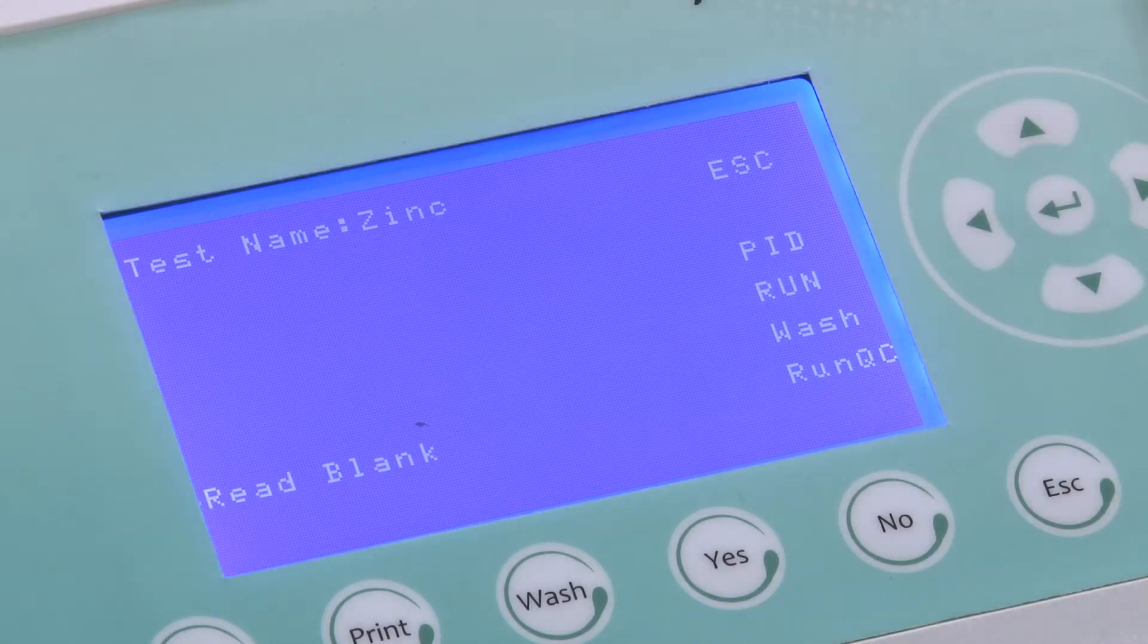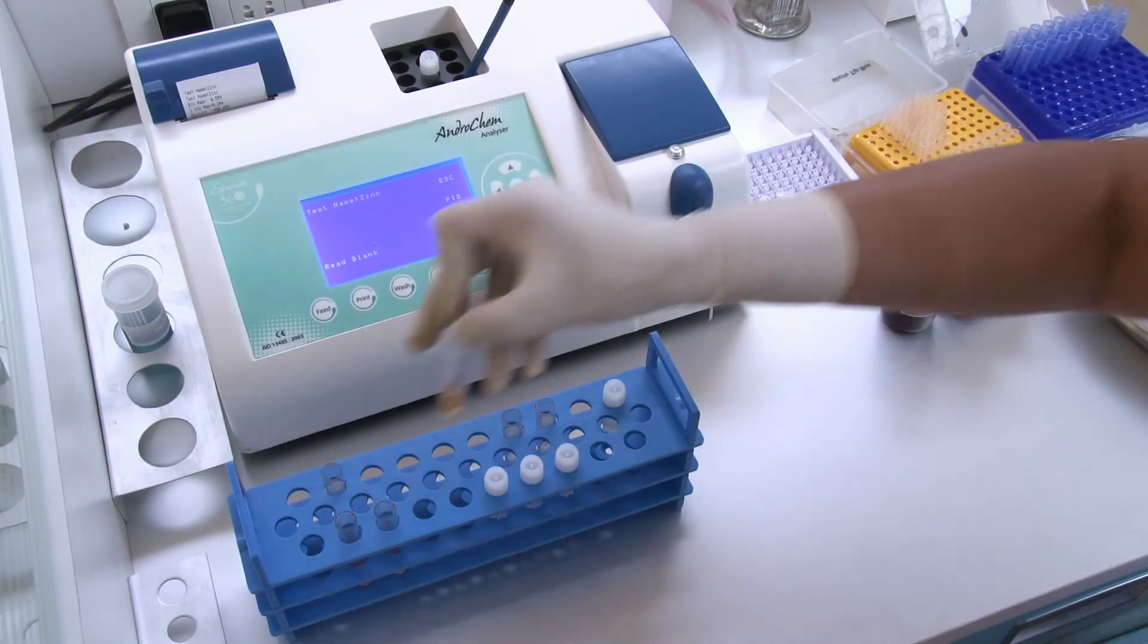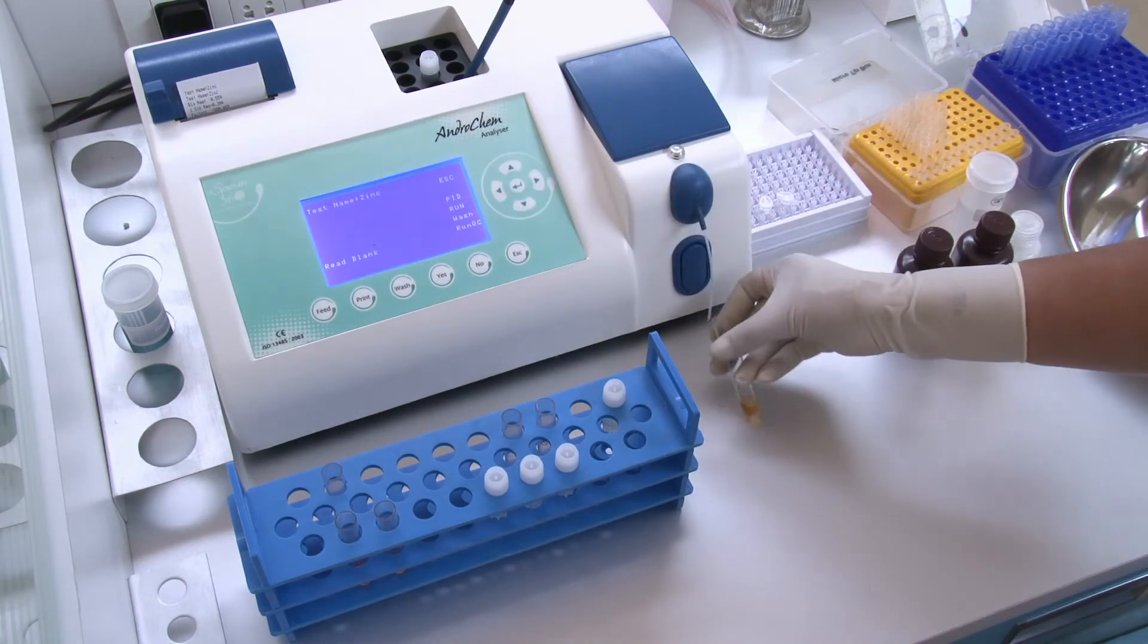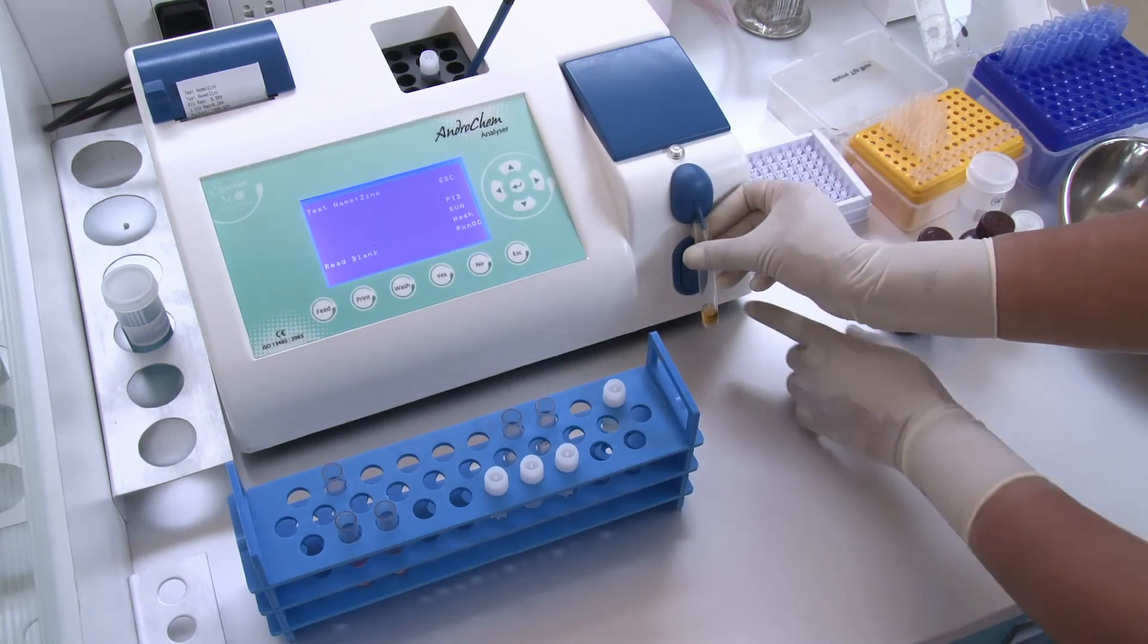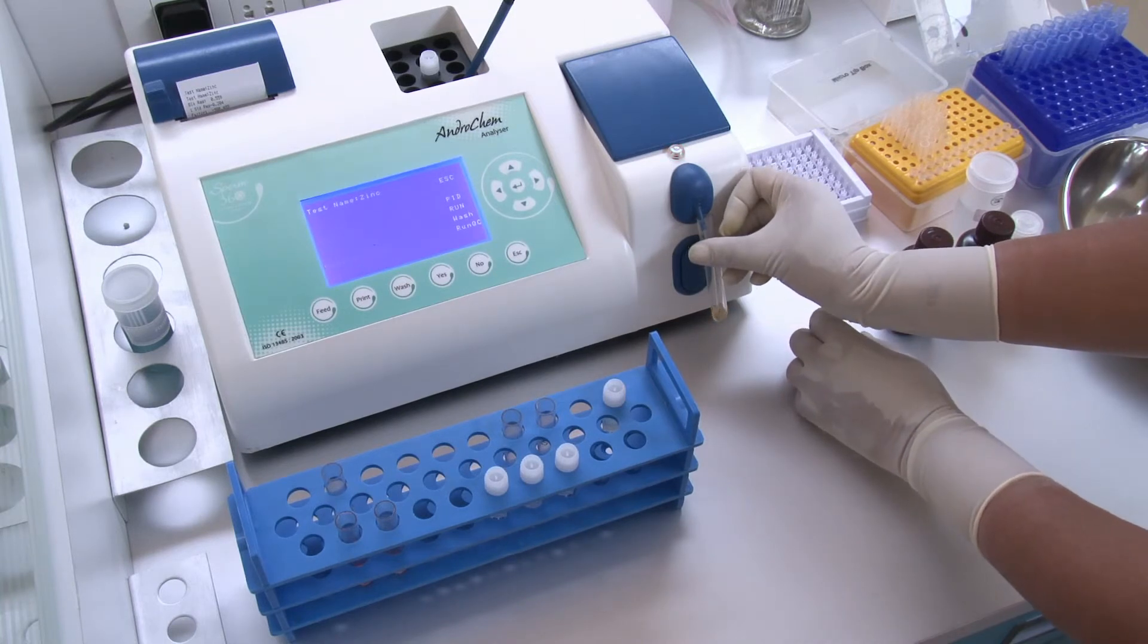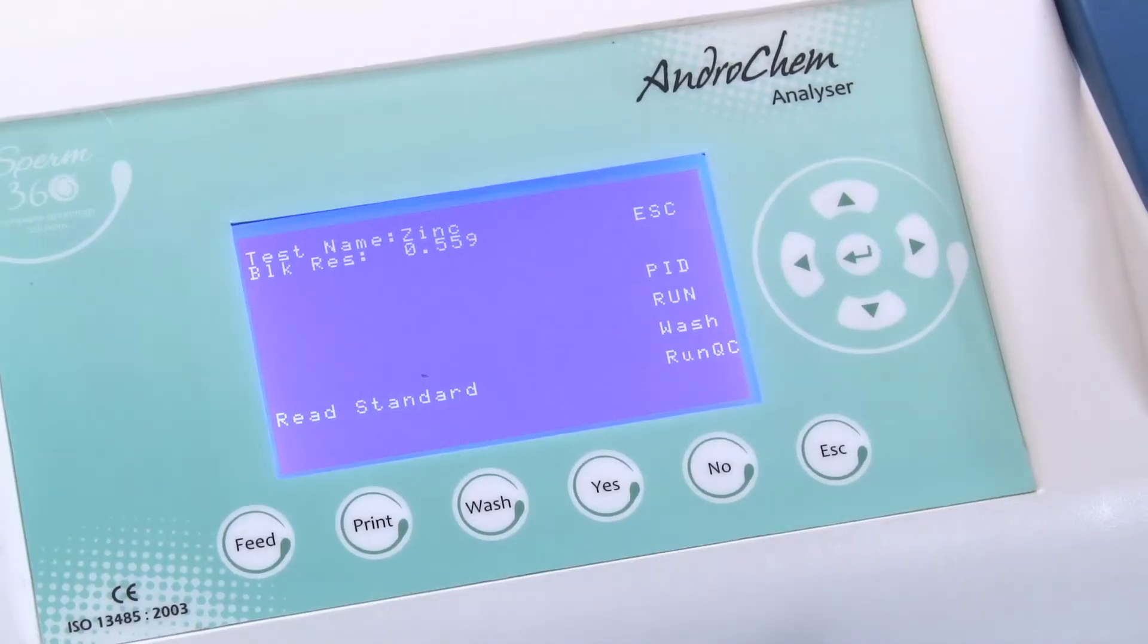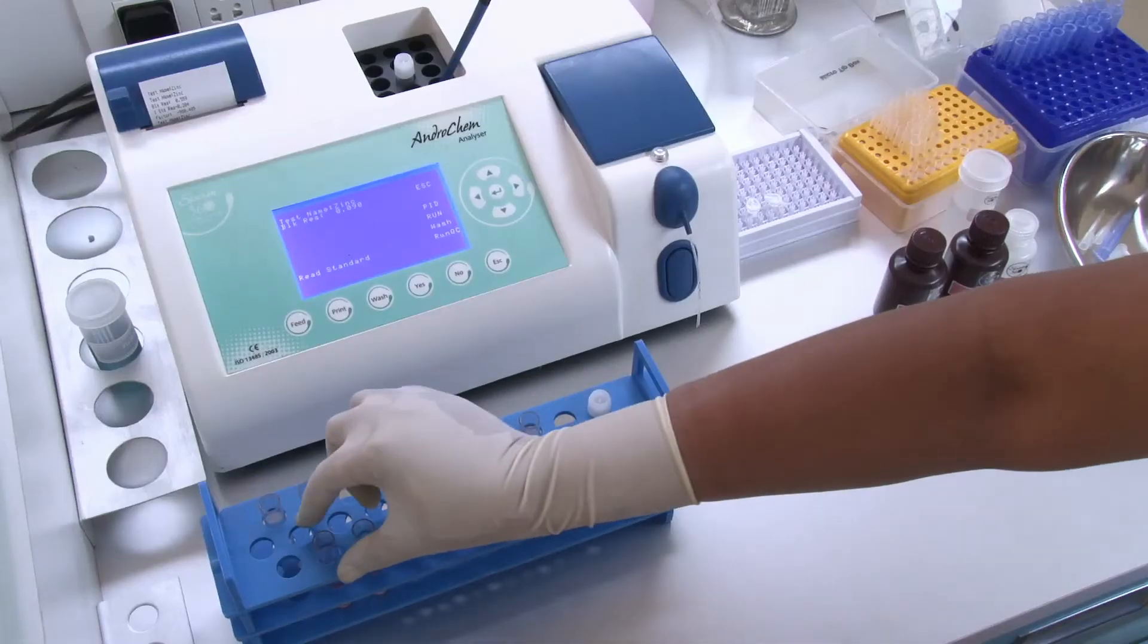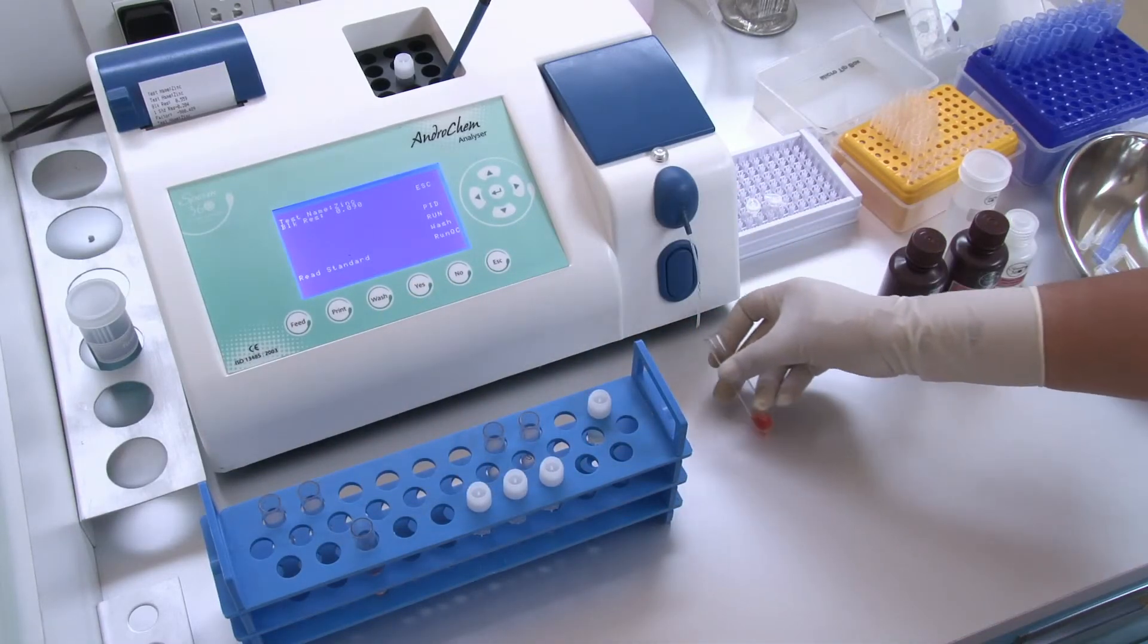The screen displays Read blank. Aspirate blank. The screen displays Read standard. Aspirate the standard.